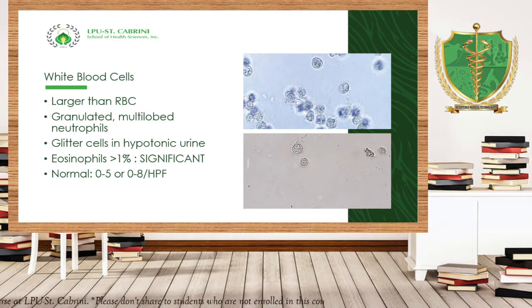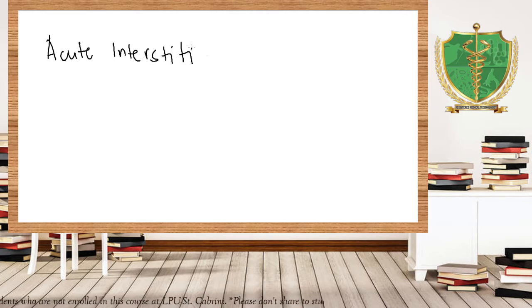That is an indication of allergic reactions or acute interstitial nephritis, this is a renal disorder which will be discussed in the next topic.